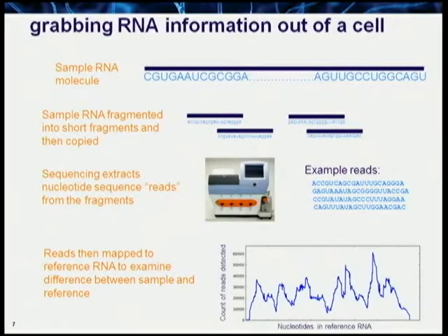So now I'm going to take you through this tour that I promised. So first, I was going to talk about sequencing analysis. And here is a 10,000, maybe 10 million foot view of RNA sequencing. So you can imagine this bar across the top is an RNA molecule in a sample. And I've just labeled the nucleotides to provide context.